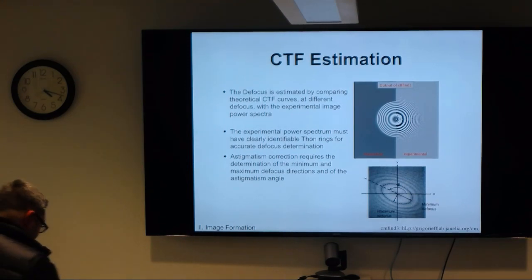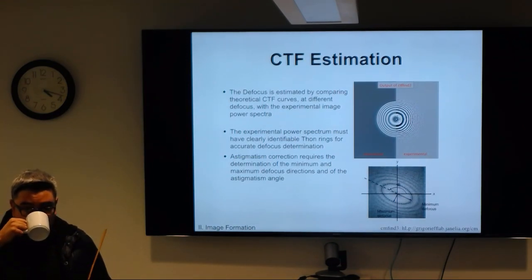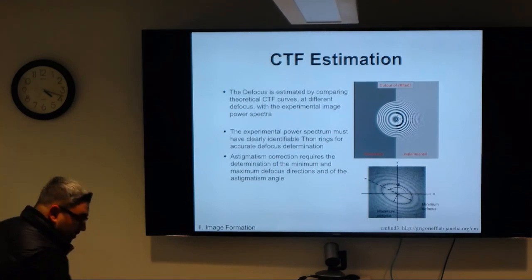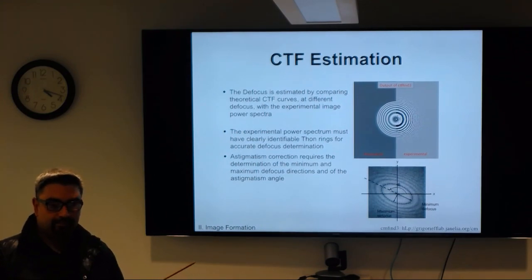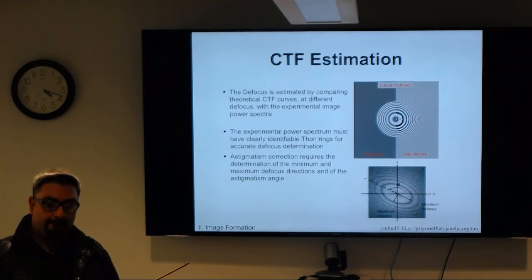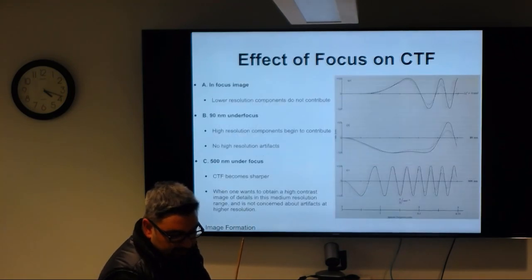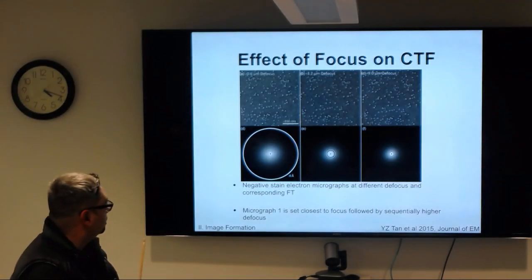And you can actually sort by that resolution. So if you're going on to do your 3D reconstruction, you might want to ignore images that only have information out to 12 angstroms if you're going for something really nice, near atomic. So understanding what that means will help you filter out certain micrographs by looking for Thon rings that correspond to ice, and by going through and looking at your CTF estimation and seeing what resolution information you have in each micrograph.